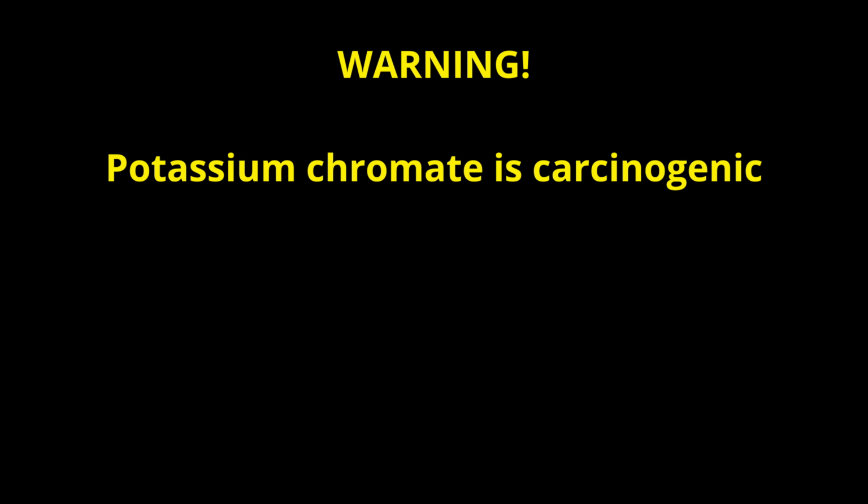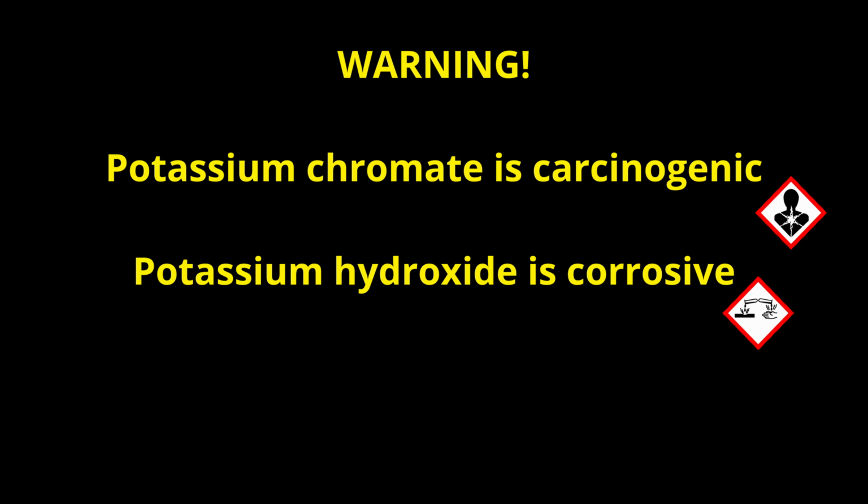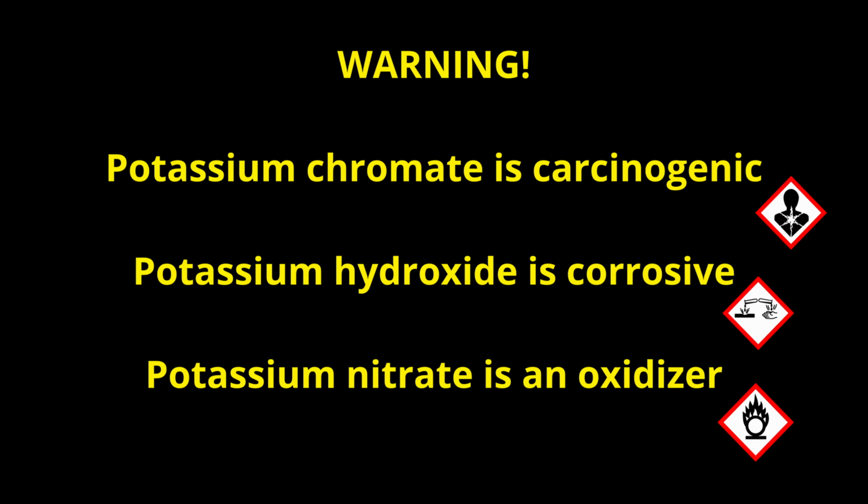Warning: potassium chromate, as every chromium 6 compound, is classified as a 1A carcinogen, meaning it is carcinogenic to humans. Be very cautious while handling it. Potassium hydroxide is corrosive, and potassium nitrate is an oxidizer. With that out of the way, let's get on with the synthesis.